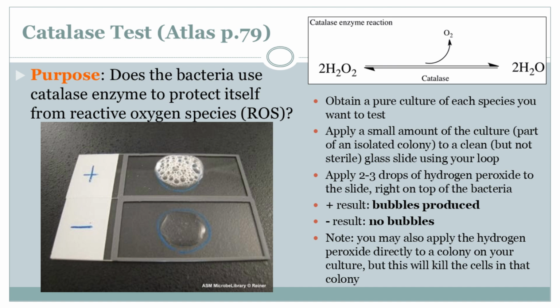So, to sum it all up, the catalase test helps us figure out if bacteria produce the enzyme catalase, which tells us whether they prefer oxygen-rich environments or not. And that knowledge has huge implications, from diagnosing infections and developing new antibiotics to understanding the evolution of life on Earth and maybe even beyond. All thanks to some tiny bubbles and a whole lot of scientific curiosity.